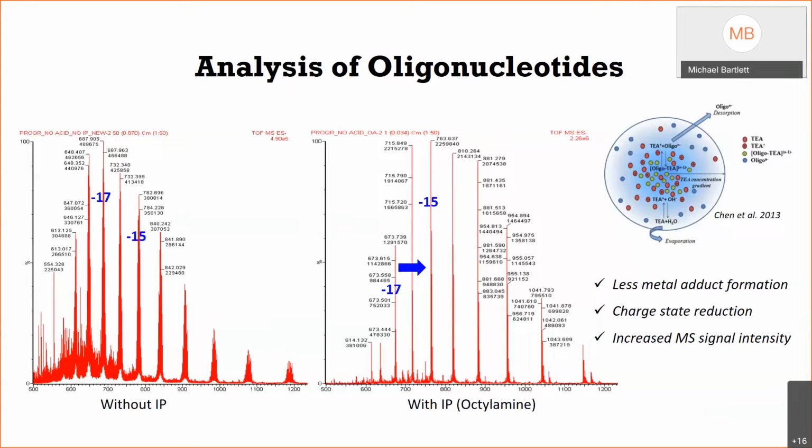And so I think a lot of people have thought about ways to remove the ion pairs from the mobile phase and perhaps use mixed mode columns that may be able to give you the separation, and are worried that the ion pairs themselves are hurting your electrospray response. That is absolutely not true. The ion pairs themselves actually have an important role in the sensitivity of the electrospray method, and it's going to be difficult to actually remove them from the mobile phase without really hurting your methods.